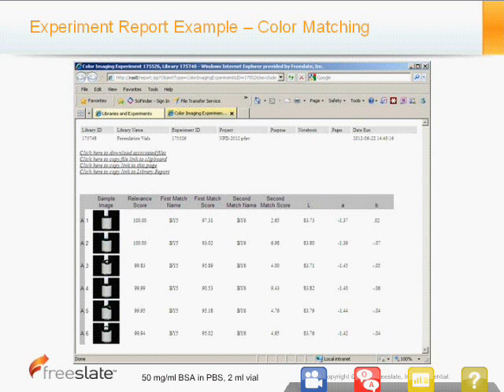And you can see here for BSA, the BY standards are actually a very relevant standard set to use for your samples. And then, at least here, we measure the top 2 match scores and match names. So you can see these 6 replicate samples all match very closely to the BY5 standard.